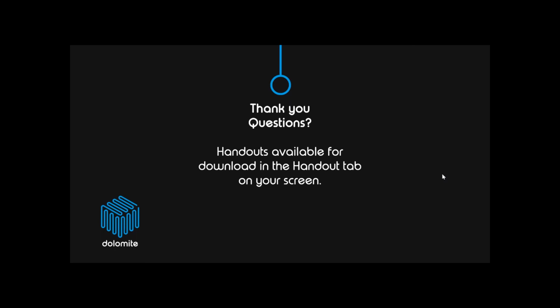For bulk production, what is the maximum volume that can be collected? So when you're doing bulk production, so this is the continuous production, you would bypass the loop. So where you have your pressurized input store holding your driving fluid, you would simply load your formulation there. So your NP precursors would be loaded directly into the pressurized input store. So there's no limit on how much you can process, and there's no limit how much you can actually collect at the other end. So it's just a matter of you changing bottles, for example, have a big collection vial.